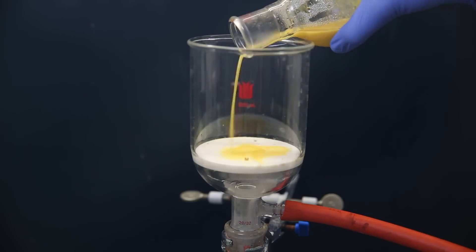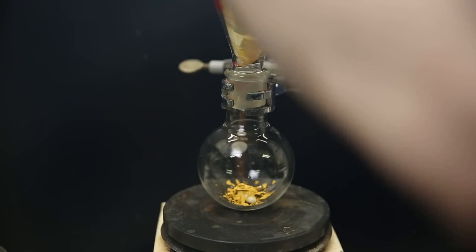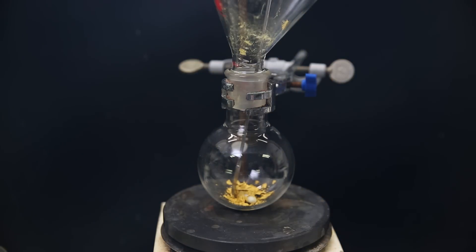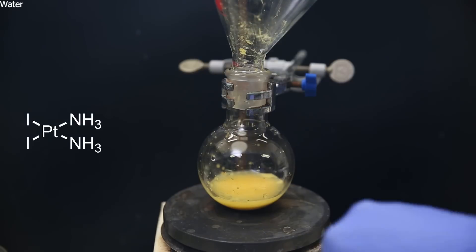I then filter it all through a glass frit with a filter paper on top. And I wash it with some water and then with some methanol. I scrape it off and put it in a new flask. I then add some water to suspend the solid and wash it off the spatula.